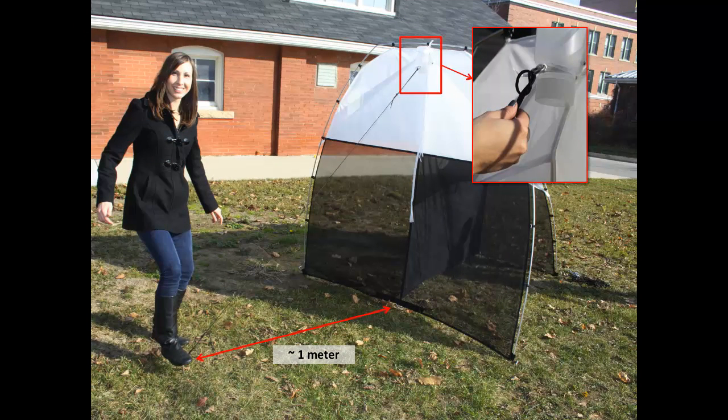Similarly, tie a rope to the middle loop at the front end of the trap and stake the other end of the rope into the ground. The trap should be standing firmly at straight perpendicular angles to the ground.